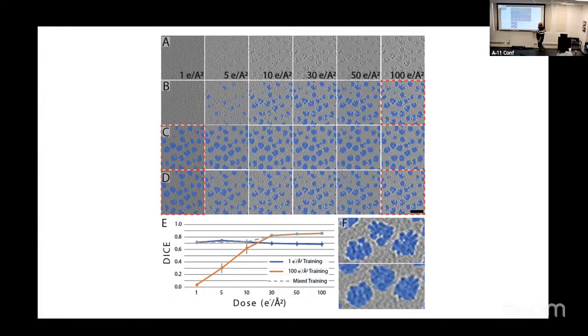It just depends on how much of a completist you are in a sense. These are really nice silhouettes of the ribosomes, where these are kind of not. So why not just train on both? That's what we do now. We train on both, and you get this network that kind of does well in all cases.